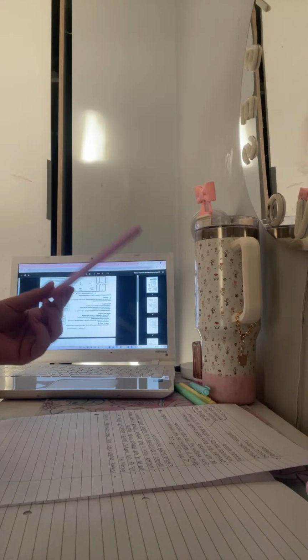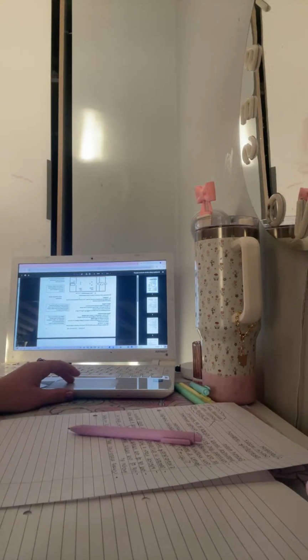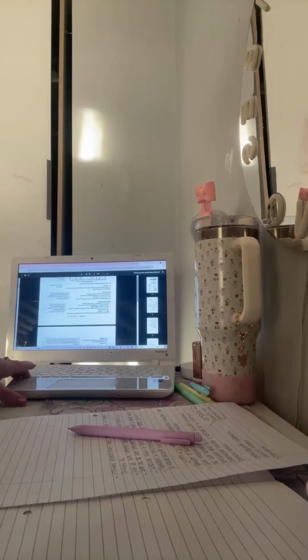The difference between them is that electrospray ionization is used for larger organic molecules, with softer conditions, whereas electron impact causes larger organic molecules to fragment, so we don't want that to happen. Actually, I guess it depends. But anyways, that's what we have to remember.